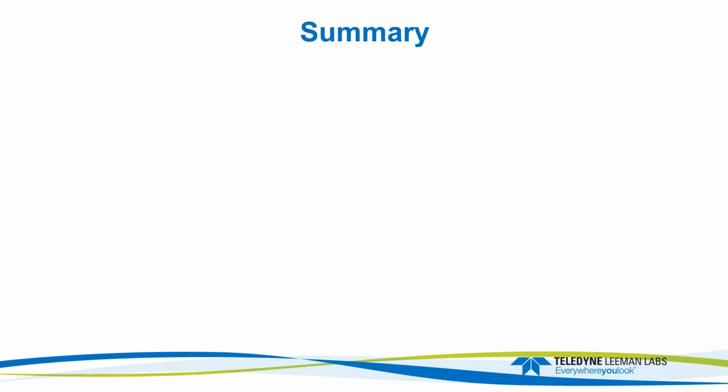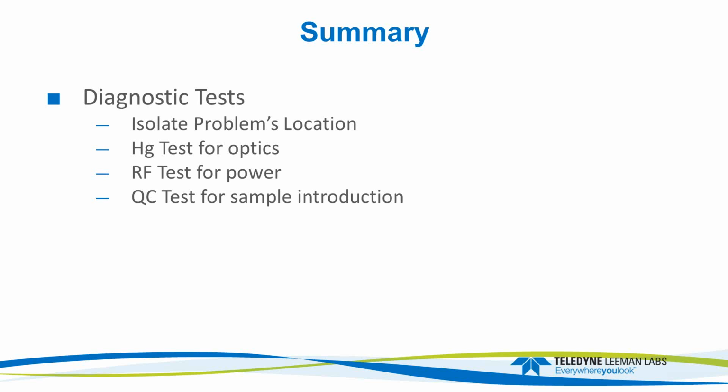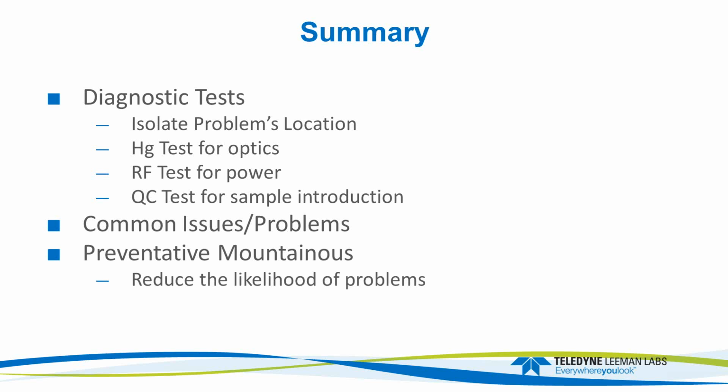Okay. So the summary. We have some diagnostic tests that you can do. You want to isolate the problem's location: mercury test for the optics, the RF test for the power, QC test for sample introduction systems. We looked at some common issues and problems that we all suffer through, and then preventative maintenance.